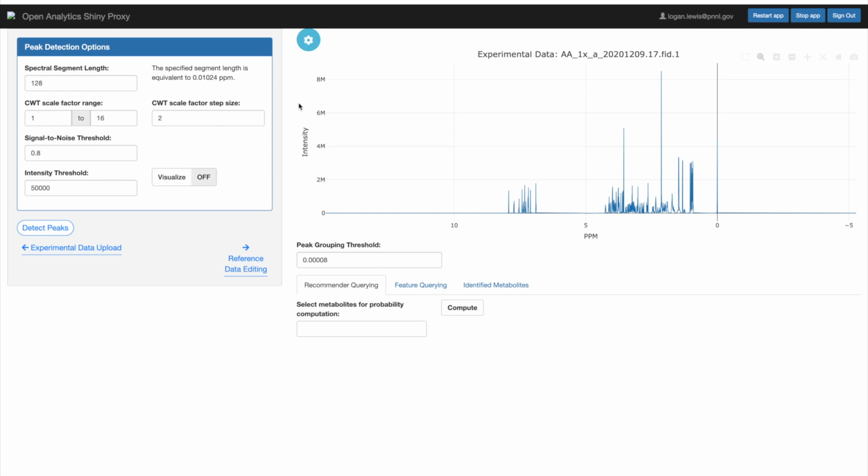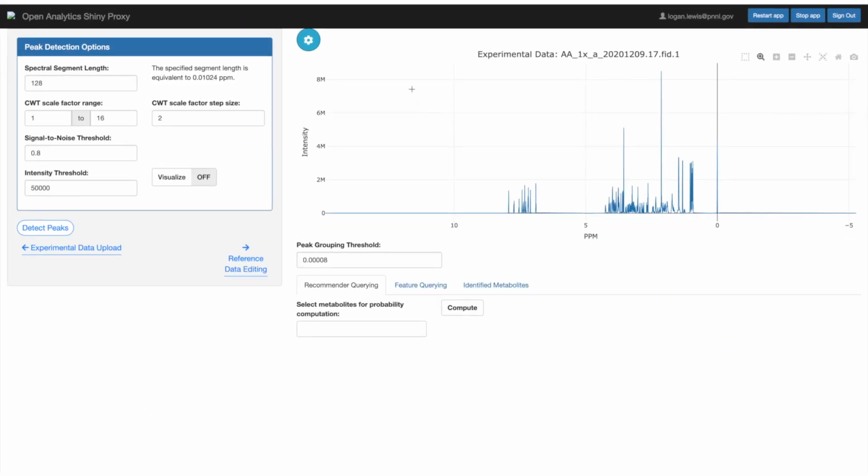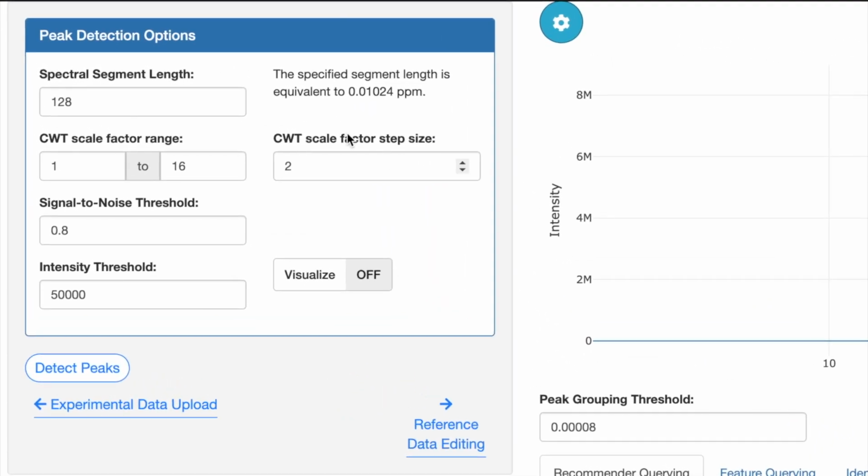This is the metabolite identification page for the nmRanalysis app. In the graph to the right, users will see that the filters from the previous page are carried over if they had specified them. In the top left corner of the page, users can choose to use our Detect Peaks tool. This step is optional, but it's meant to automatically highlight regions of potential interest.